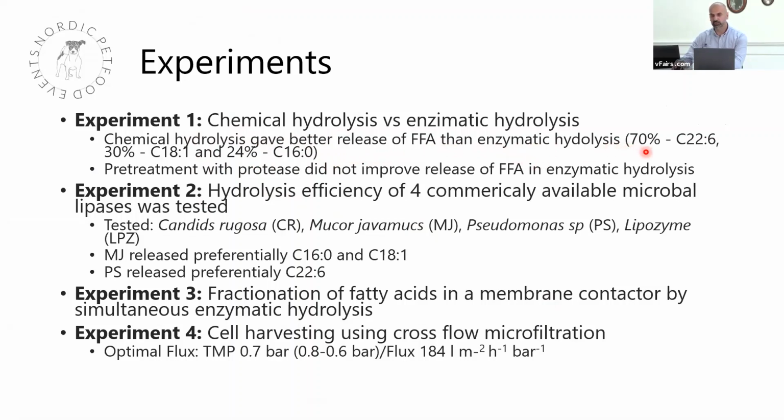It extracts 70% more C22:6, 30% more C18:1, and 24% more C16. And the pre-treatment with proteases didn't improve free fatty acids in enzymatic hydrolysis. So chemical is better.